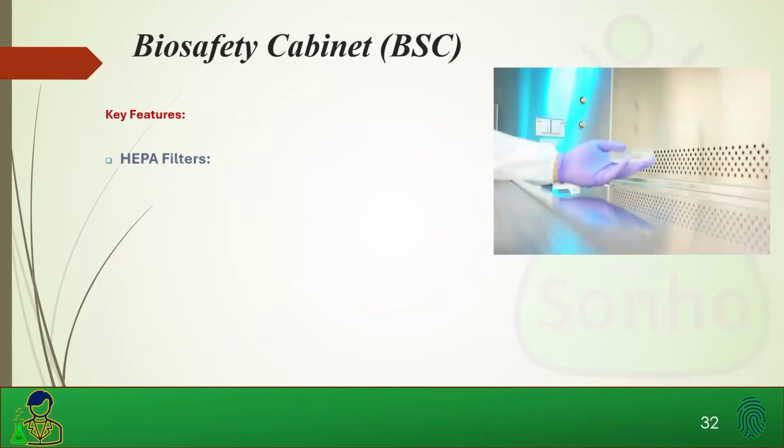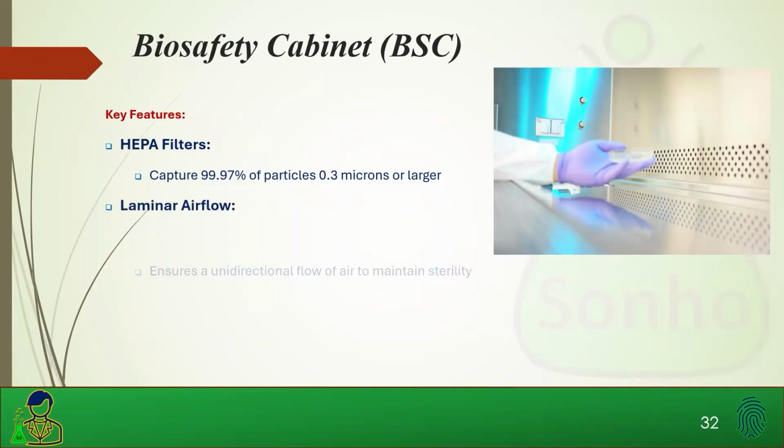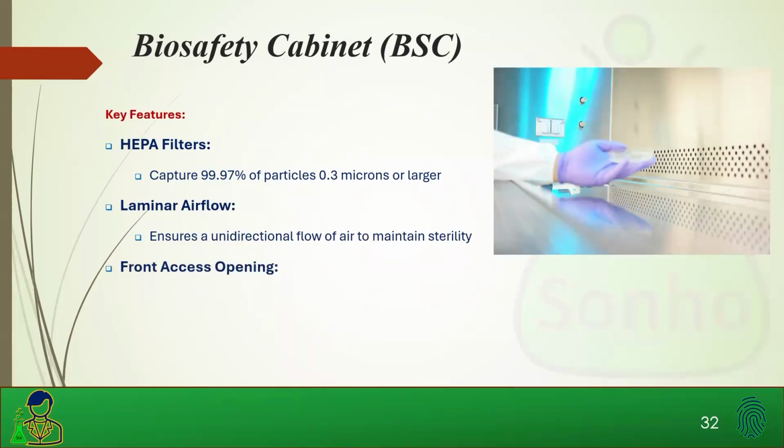The key features. They have HEPA filters. These capture 99.97% of particles 0.3 microns or larger. They have a laminar airflow. This ensures a unidirectional flow of air to maintain stability or sterility. And a front access opening. This allows for manipulation of materials while minimizing risk.